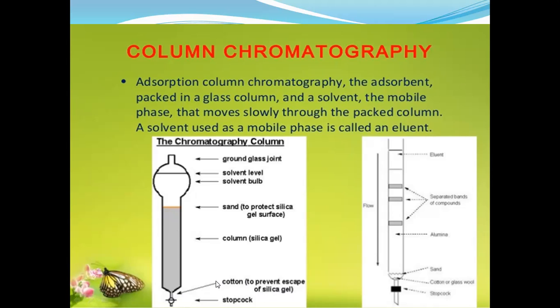Followed by that, we fill this column with silica gel. After that, at the surface of the column we add a little amount of sand.